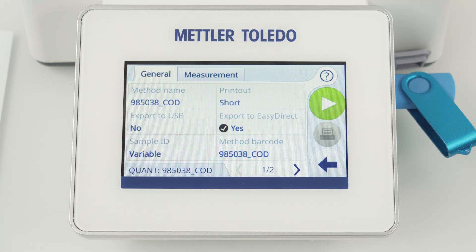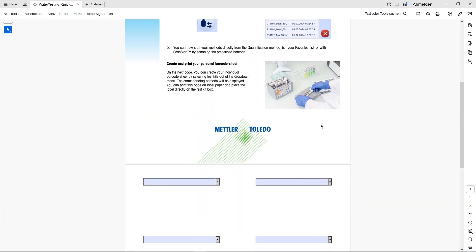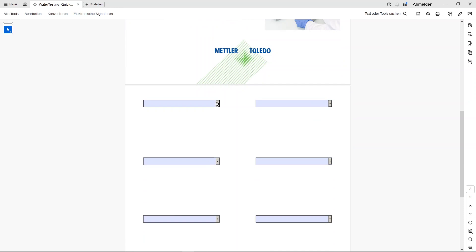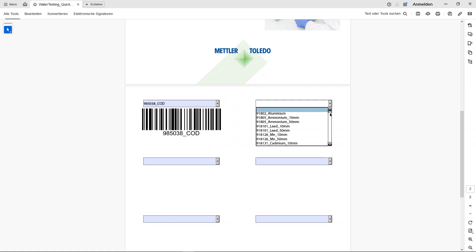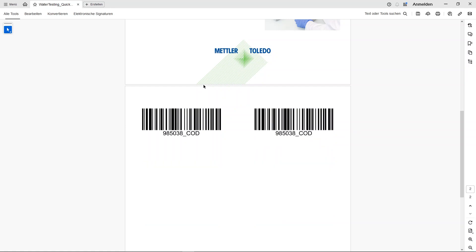But where do you find the barcodes? In the same method zip file you just downloaded, you will find a PDF template to print the barcodes for your test kits. I will select the COD test kit 985038 from the drop-down list. The layout of this document is compatible with Avery labels in DIN A4 and US letter format.